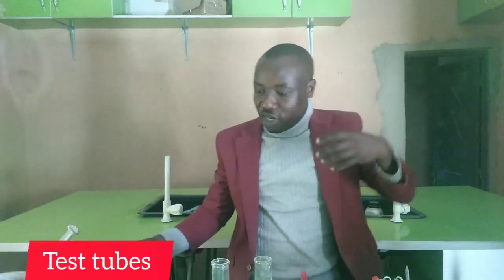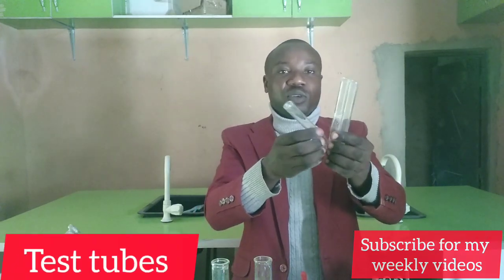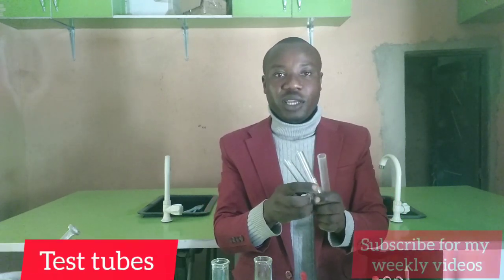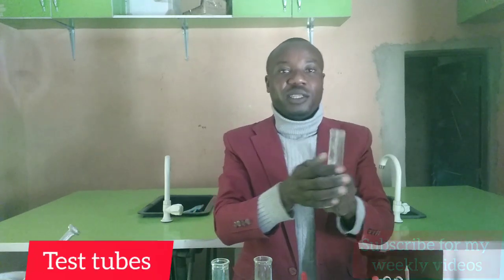Now let's proceed further. I'll be showing you the test tube. Those are test tubes. We have two types of test tube, but the one I'm holding right now is the boiling test tube. You can see it has a rim and a bigger diameter.